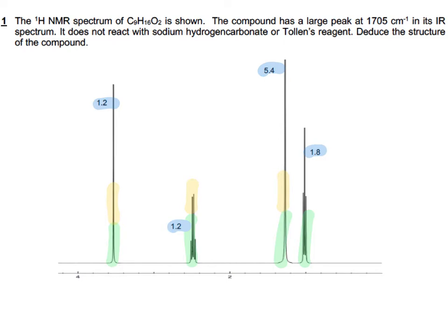And the final one, on the right, has 3 lines in it. So we would refer to the one on the far left as a singlet, the second one as a quartet, the third as a singlet, and the final one as a triplet. We're going to understand why that's happened. That's something else that we're going to consider.